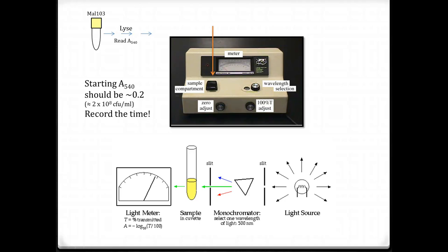You tell the machine then, what's called zeroing the machine, you tell the machine what nothing looks like. Okay, this is setting the machine to zero. And what you do is you aim this, looking at the screen, the meter here on the center of the machine, you aim the needle at the zero on the left side of the meter. And so you're going to zero the dial, zero the needle to the left side with the left knob. So you zero to the left with the left.